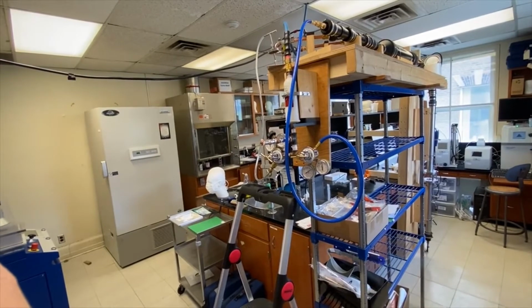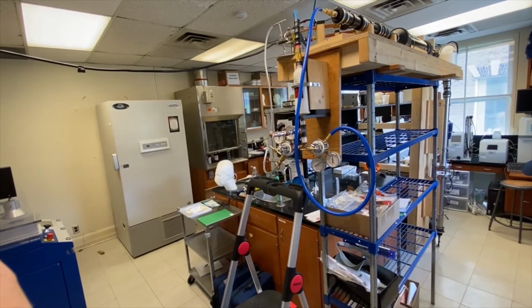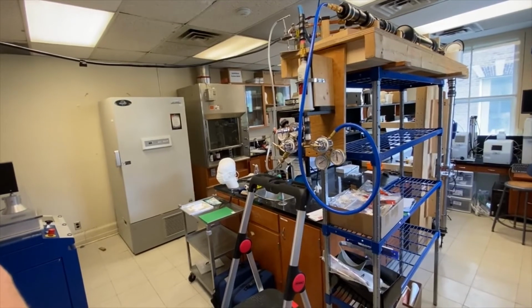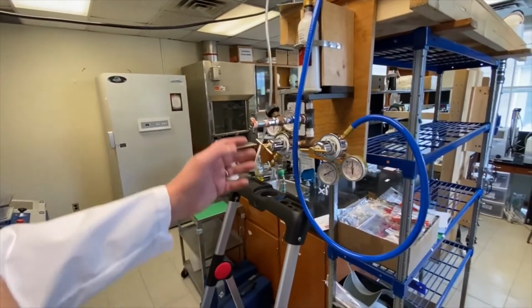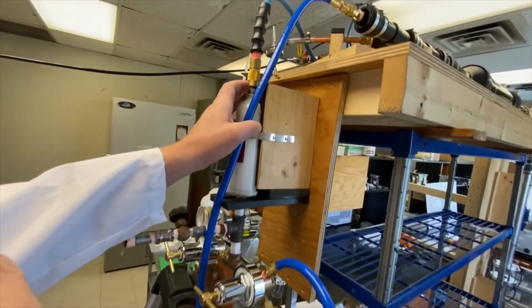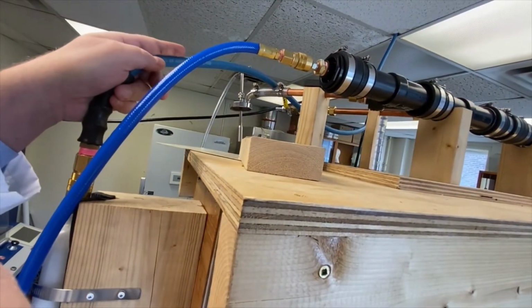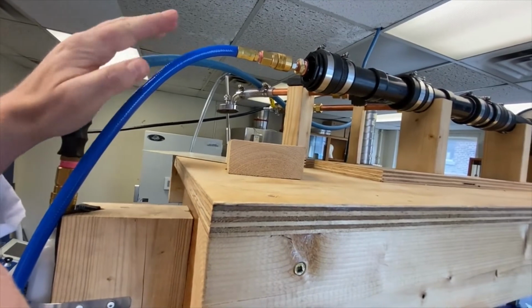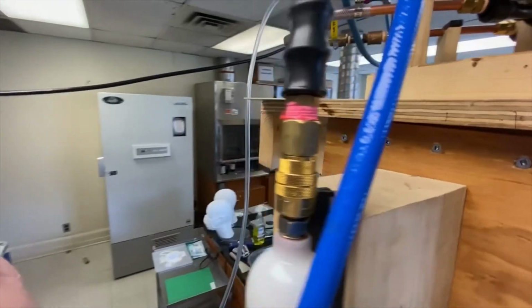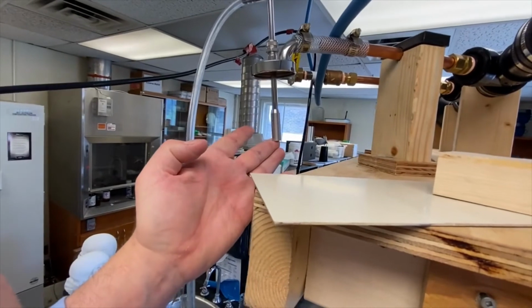So here, located on this high bench, is our ASTM 2299 test apparatus. It works a lot like the test apparatuses that I just showed you, in the sense that air comes in from a compressor and it's passed through a HEPA filter, and that HEPA filter then feeds air either into a nebulizer or into a duct. The nebulizer in this case has been removed, but if I move around you can see where it was left hanging. So this is the jar top of the nebulizer.